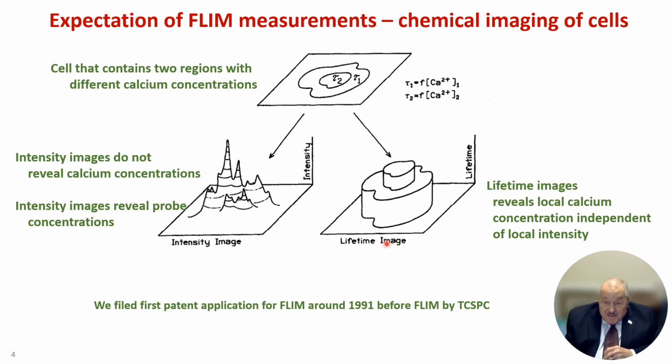So that's what we call FLIM. We create contrast, which is based on the amount of the analyte that's present. So it's an artificial contrast. It's a false color image, but the images tell you, there's so much of this species here, or there's so much of this protein that is undergoing fluorescence resonance energy transfer.